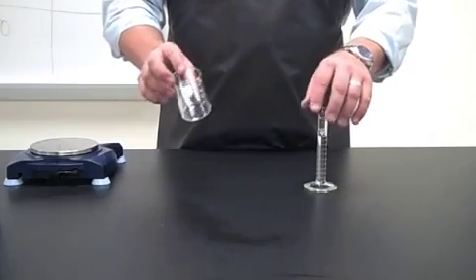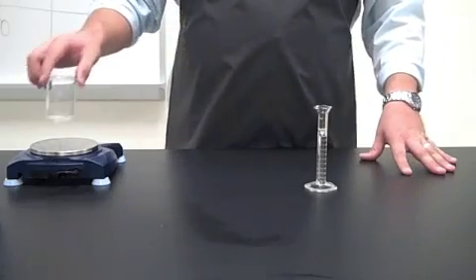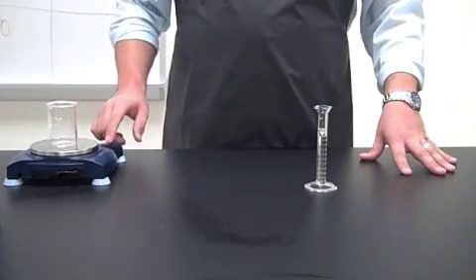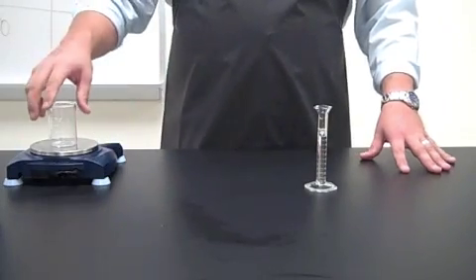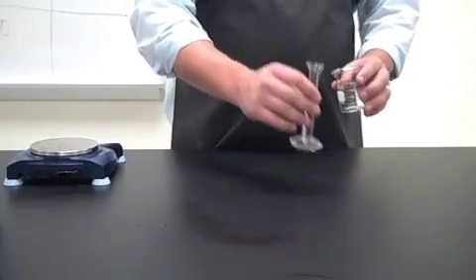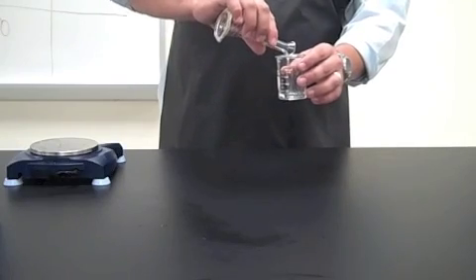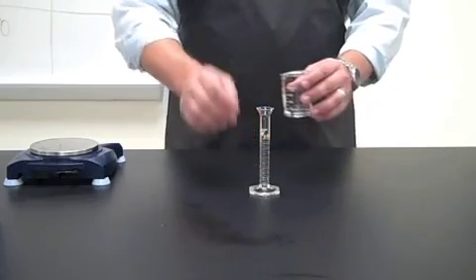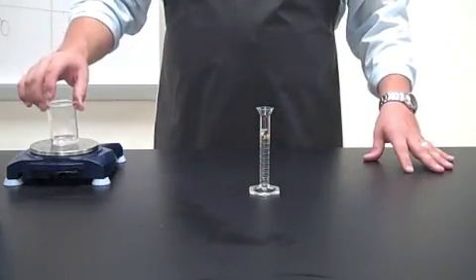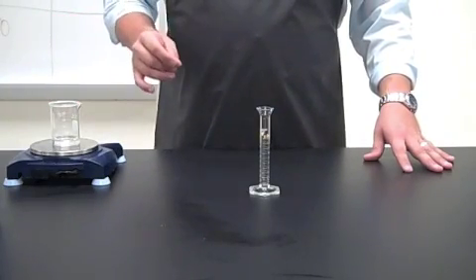Then we're going to take our 100 milliliter beaker and place it on our balance, and we're going to zero out the balance. After we zero it, we're then going to add in our distilled water. We put it back on the balance and we measure the mass of the distilled water.